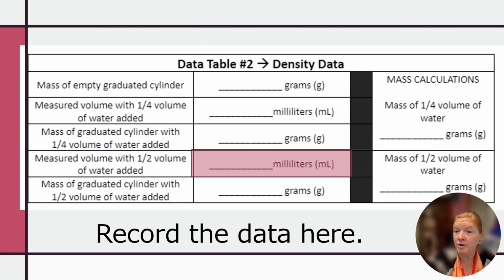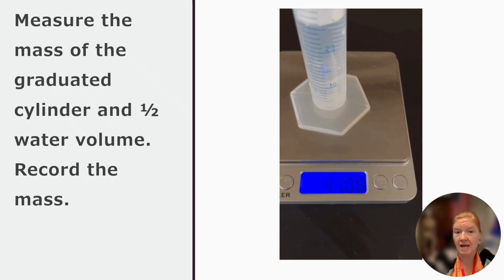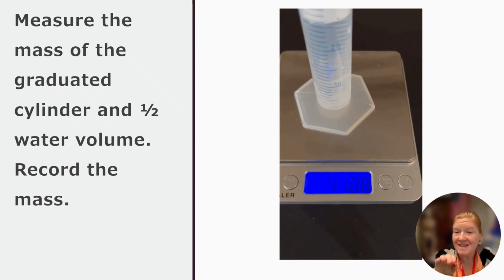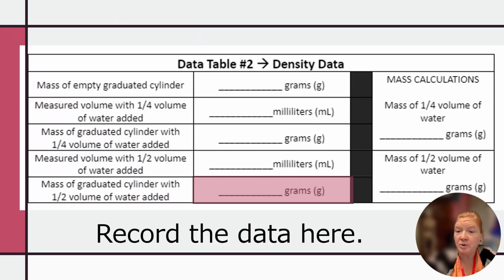And I'm going to record that right there in the table. Then I am going to measure the mass of the graduated cylinder and that volume of water. Okay, if you are absent and recovering lab minutes, this is the number you are going to record. And I'm going to put it in the table right there.